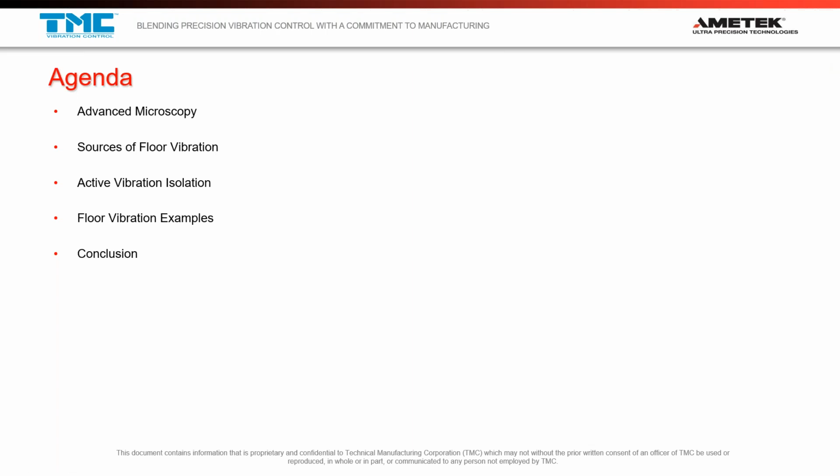These will be simply photos showing before and after when we've had a vibration problem in a microscope image, for example, and the result of solving that vibration problem. So we're going to talk a little bit about the problems we're trying to solve here and the results. And then after a brief conclusion, we'll let Brian go and talk a little bit more about piezos in depth.